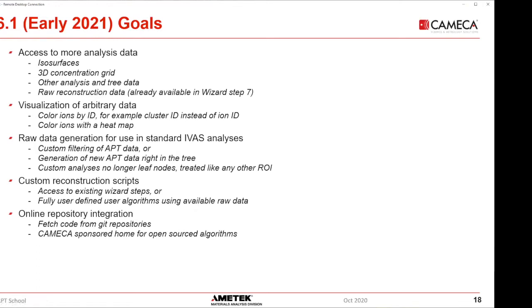We're also making available, so I talked about this a little bit, which is you can generate your own filtered data from a custom analysis node. And one thing that I think might be quite interesting to some people is you could also generate totally fake data from a custom analysis node. So if you wanted to do little mini simulations based on things right inside of your analysis tree, you could do that.